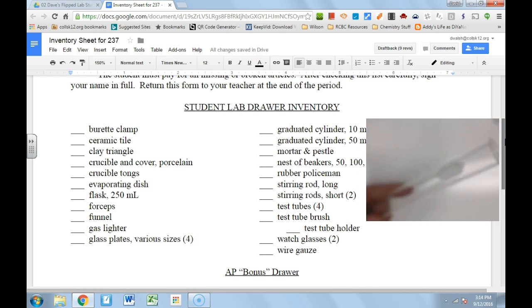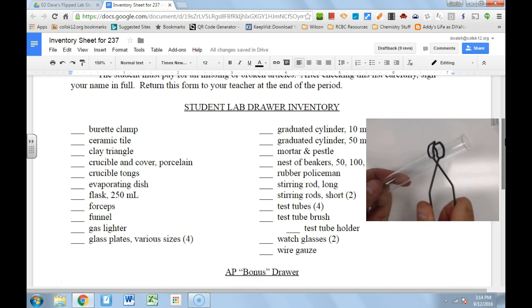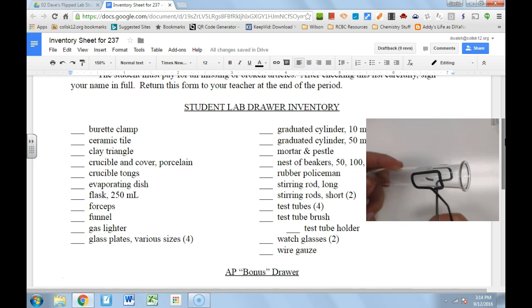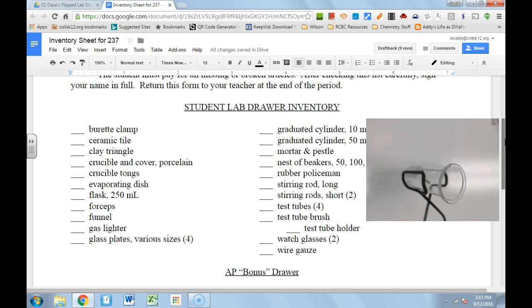And then there's this metal thing that squeezes — that is a test tube holder. Some people call it a test tube clamp, but I call it a test tube holder, not to be confused with the burette clamp. This is a test tube holder used to hold a test tube when you don't want to actually hold it in your hand — especially when it's hot.